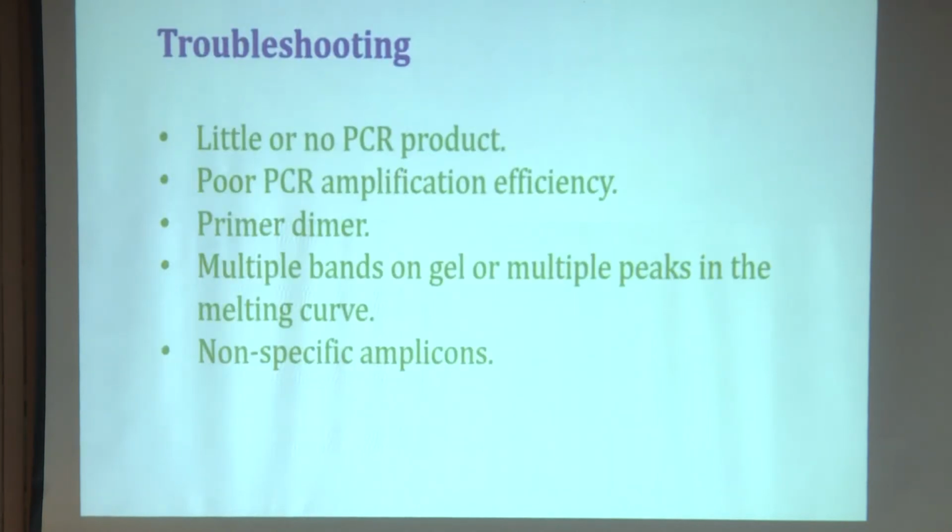Of course, you may have a problem with no PCR product. You can avoid it once you have a normal PCR done and you know your PCR products are coming for the primers which you have designed. Also, as far as qPCR is concerned, do not go for an amplicon length of more than 250. Try to keep it within 150 to 250, because a longer amplicon affects your quantification, and efficiency is also affected.